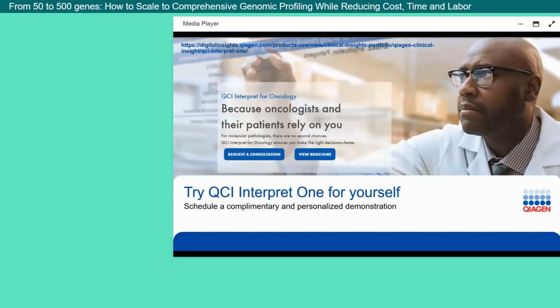You are able to search there by the gene, and you can find then all the variants by gene, and you can see across the whole gene how often you have interpreted and you have seen that specific variant and access it through that interface as well.